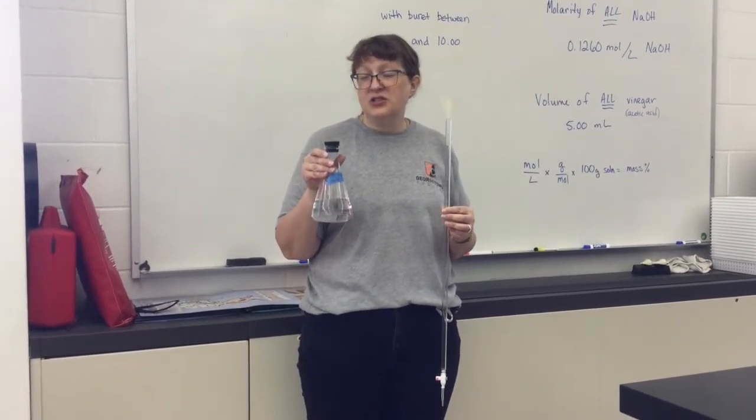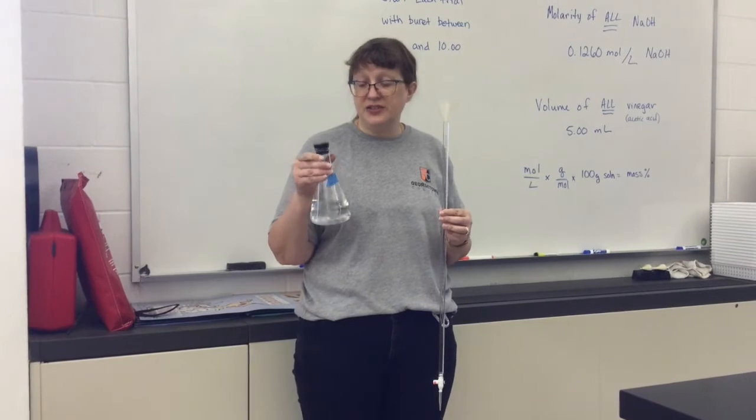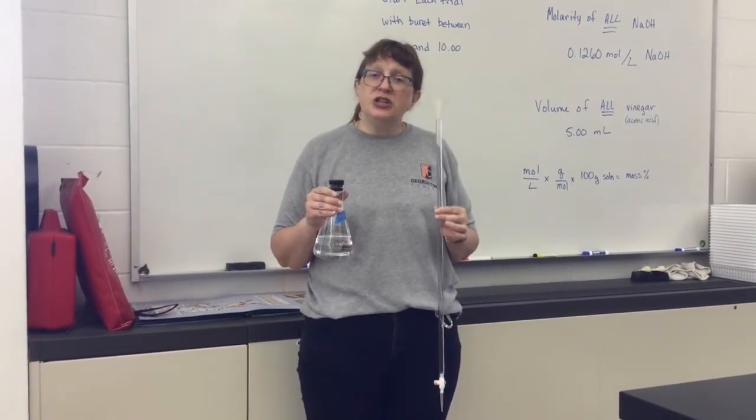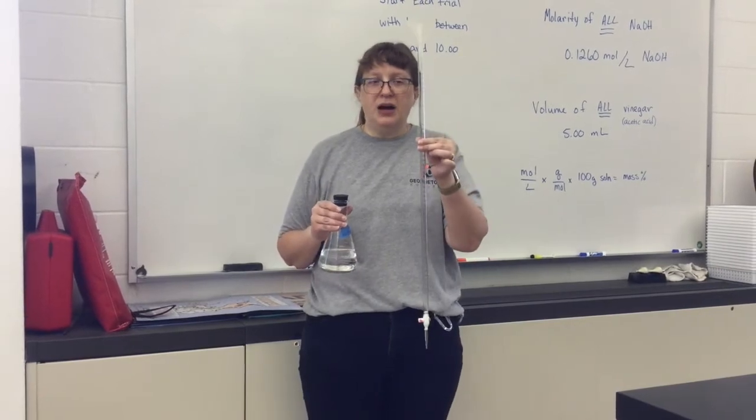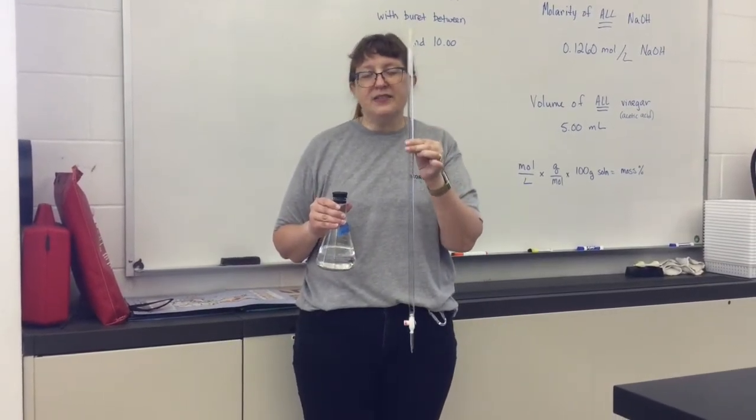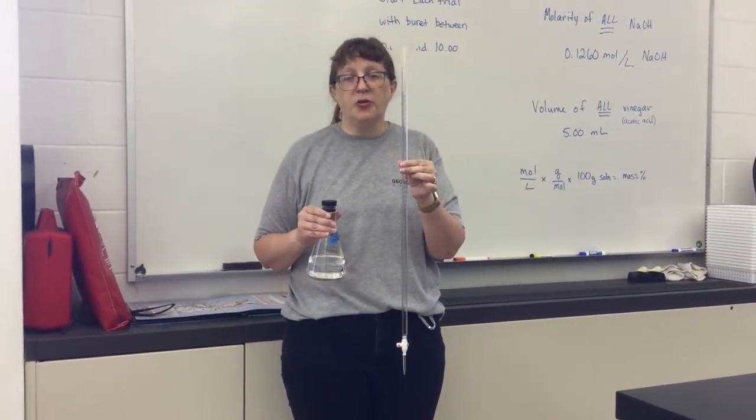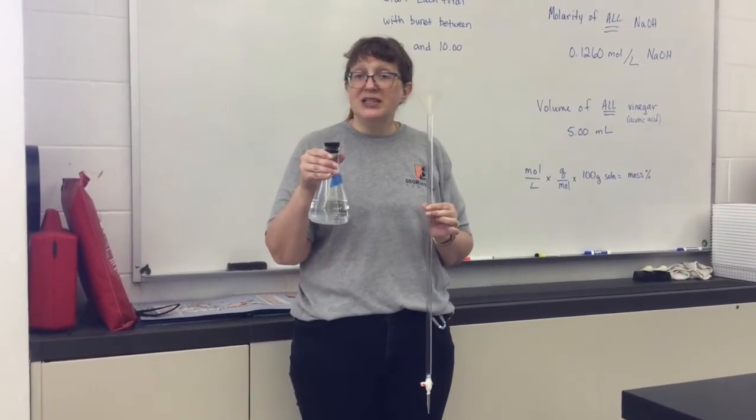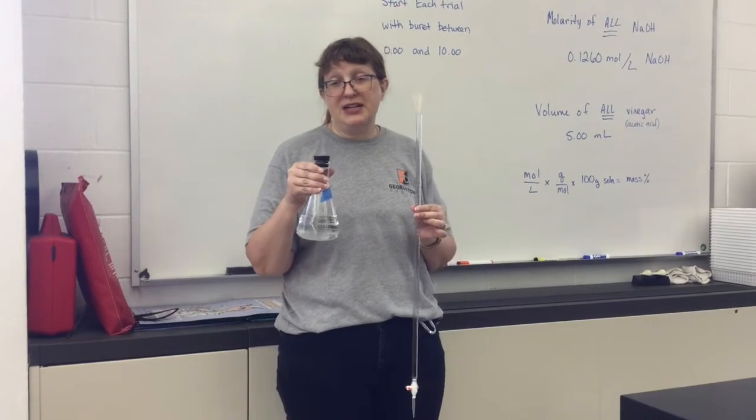It will be the same concentration for each of your trials of the sodium hydroxide. Before you begin, you can assume that your burette is clean enough that you don't need to use distilled water, but you're going to use a small amount of the sodium hydroxide to rinse out any potential contaminants that are in there.